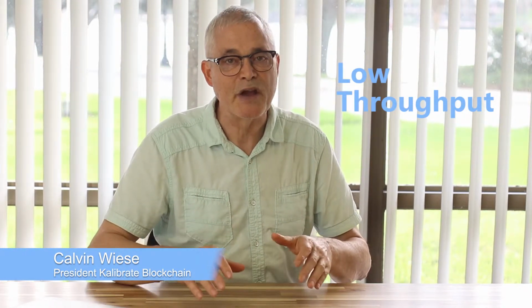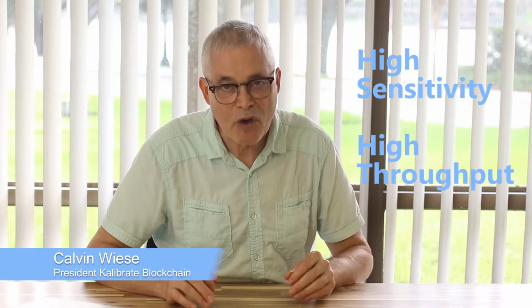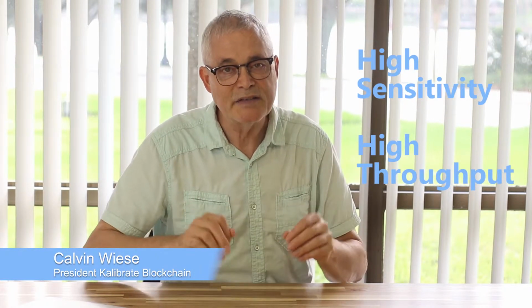Typical forms of mass spectrometry require several minutes of instrument time for detection. The instruments are very expensive, and so the cost of several minutes of instrument time is very high. Our products need high sensitivity so that we can test a lot of interesting and useful analytes that circulate in blood at low abundance. Our products need to be very low cost. Thus, we need high sensitivity and high throughput, significantly higher than what is typically found in mass spectrometry.